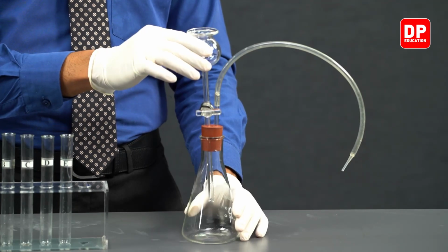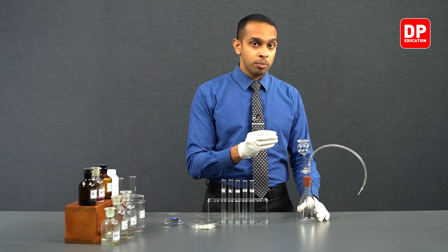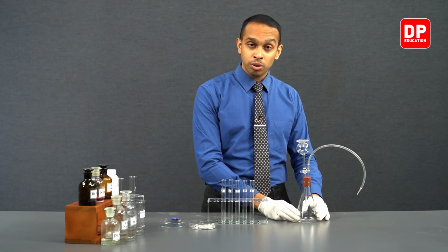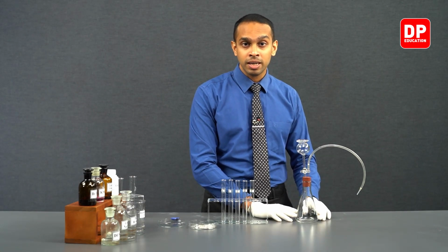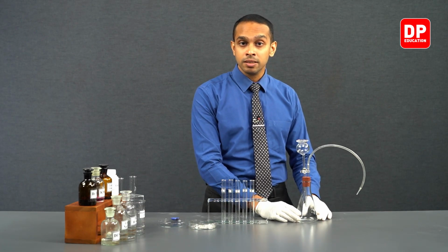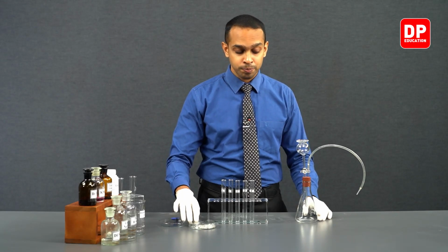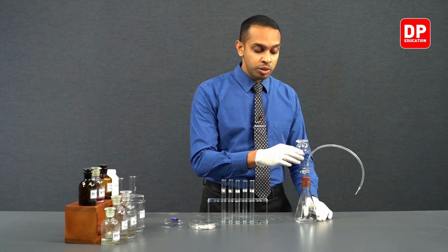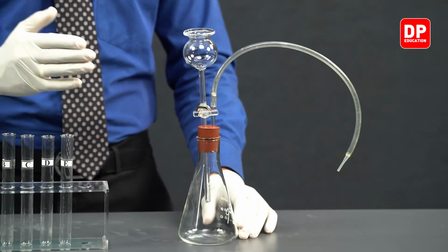Now, this thistle funnel is a good way to introduce small amounts of a liquid into the reagents that we have inside our conical flask. So, inside the conical flask, we are going to have our calcium carbide, and with the help of the thistle funnel, we are going to introduce water drop by drop, or little by little.